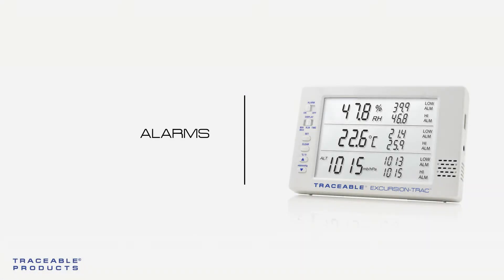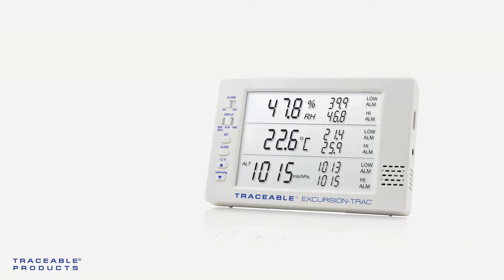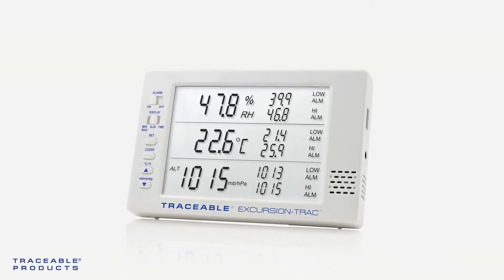In this video we'll learn about the alarm. Once an alarm has been triggered, the corresponding parameter will flash on the LCD and an alarm will beep. The alarm will continue to beep for 60 seconds and then beep every 15 seconds.